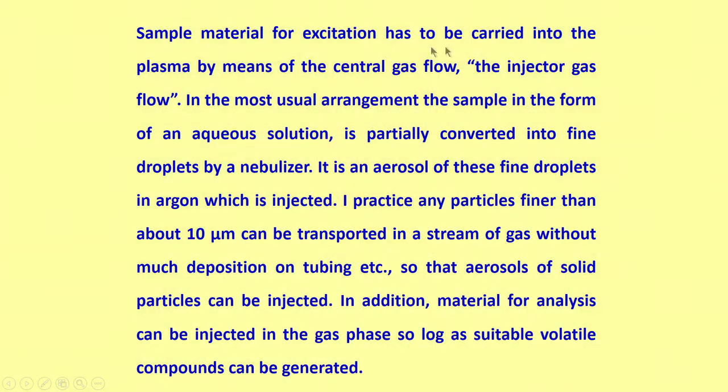The liquid samples must be carried into the plasma by means of the central gas flow, known as the injector gas flow. In the most usual arrangement, the sample is in the form of aqueous solution in 99% of ICP AES applications. That is partially converted into fine droplets by the nebulizer. So, it is an aerosol of these fine droplets in argon which is injected.